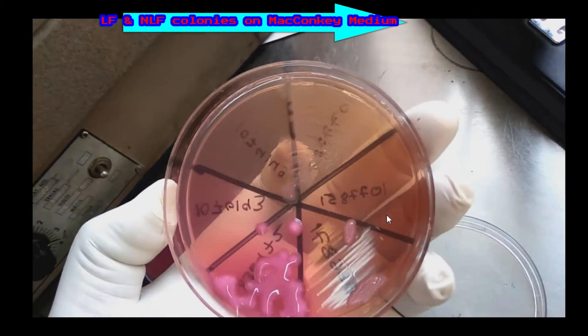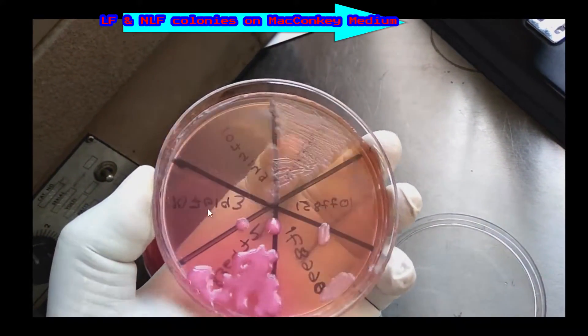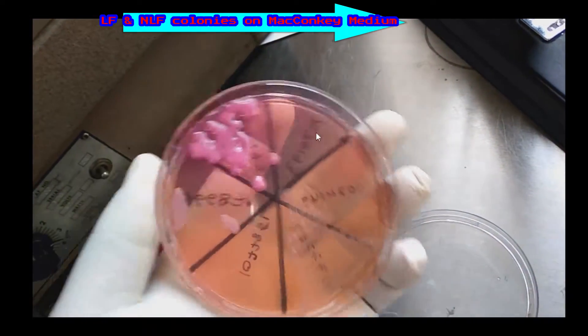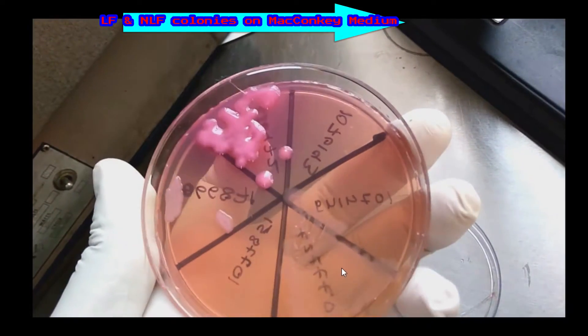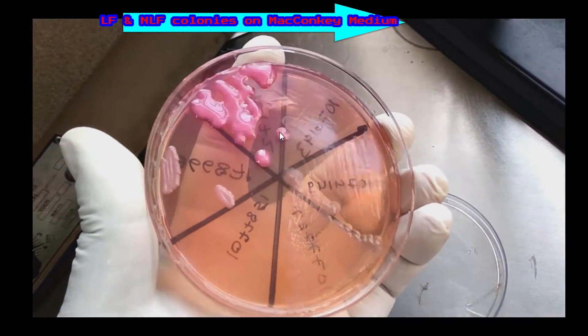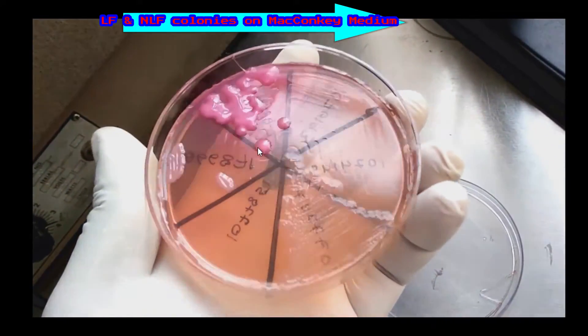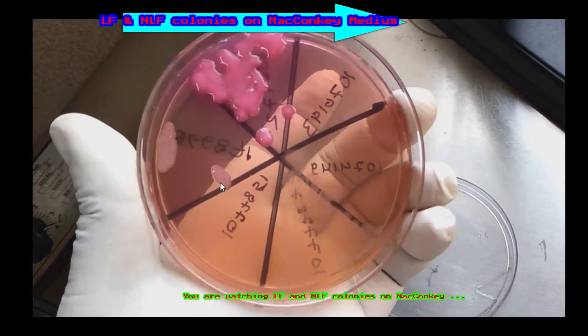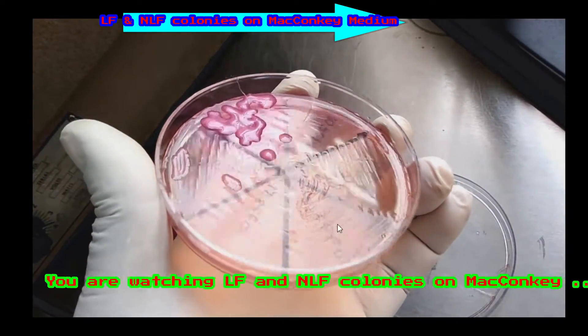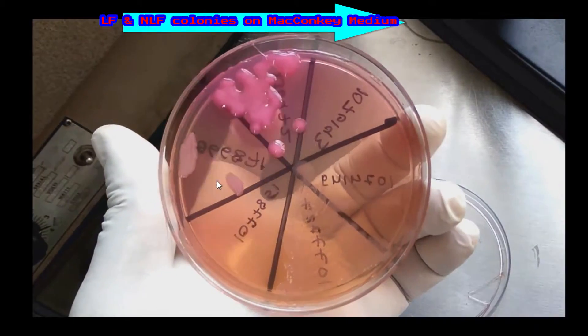The medium becomes like this if the organism is growing. Here you can see the lactose fermenter colonies. Here you can see pink in color. Here are very pale pink and colorless colonies, so they are non-lactose fermenters.